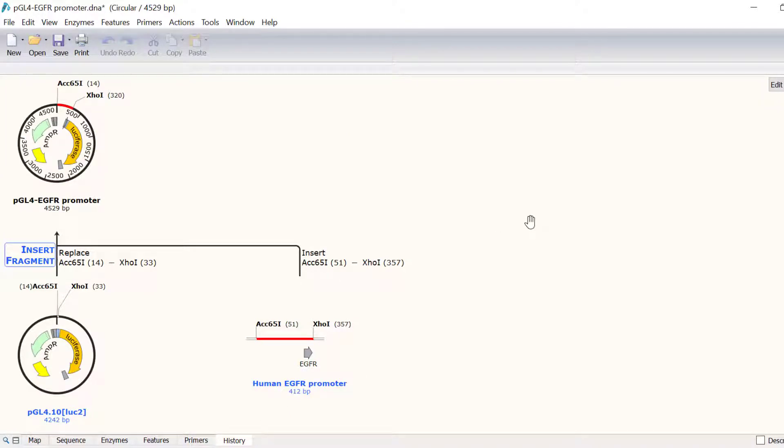There is also a quick alternative way to simulate this cloning reaction in SnapGene, and this uses copy and paste, which I will demonstrate now.